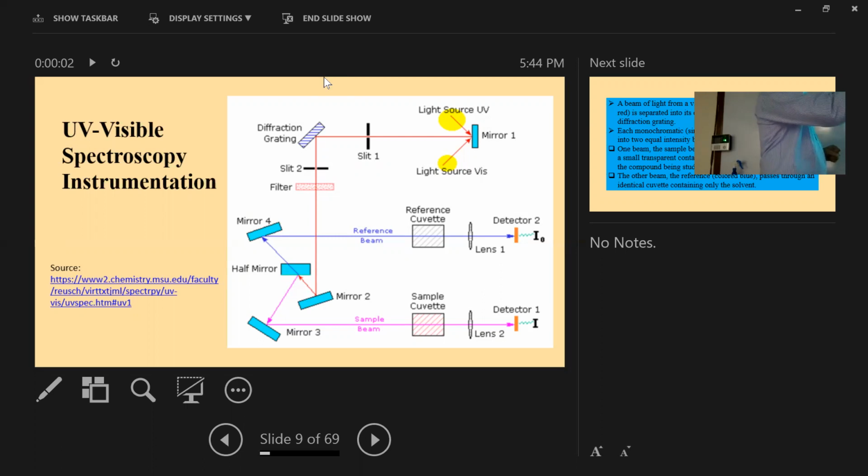Here, actually, this is not a monochromatic light. I have told you this is a visible light source, that means it has different wavelengths. Is it? Then if we use the grating, that will make this compound light, the mixture of different wavelengths, that can be considered as compound light. So that compound light will be divided into all its components.